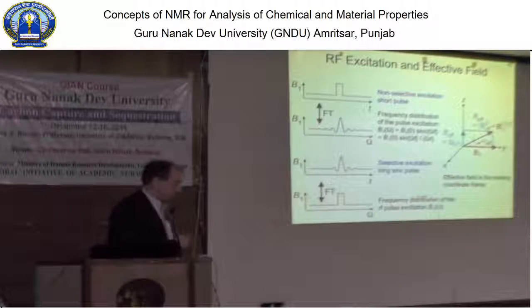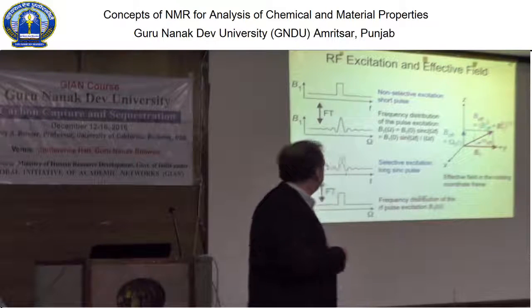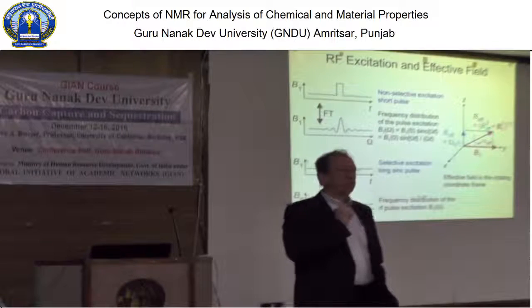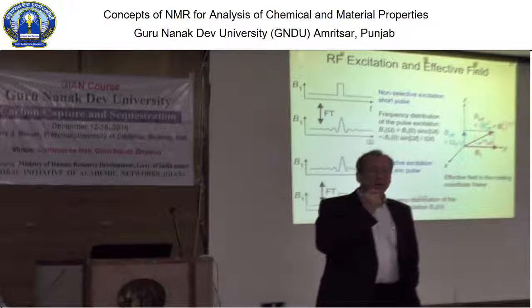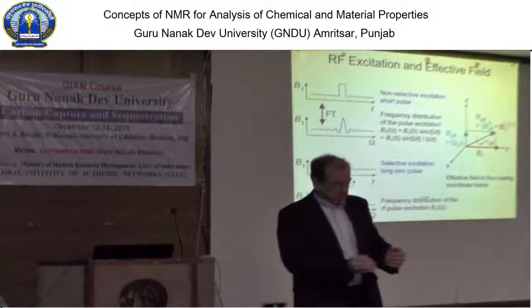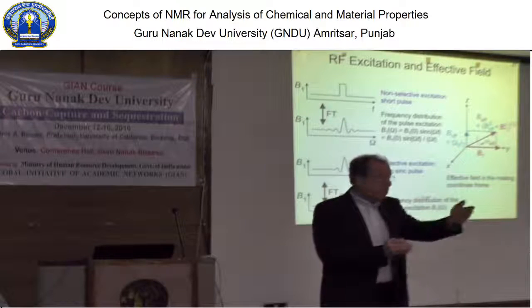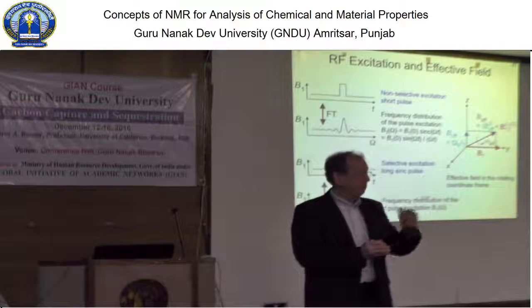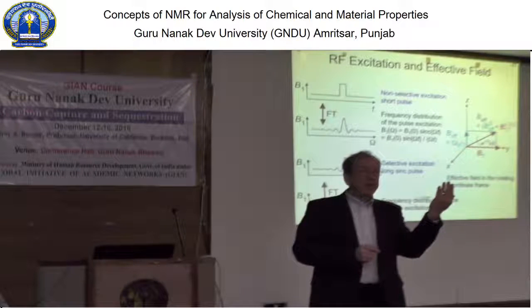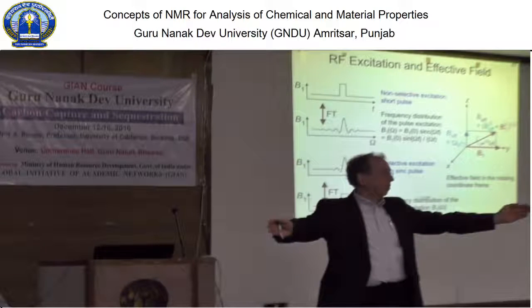Now, it starts getting a bit more complicated. If we are in the rotating frame, we are the red bicycle rider. We are exactly on resonance, with the same frequency as our radio frequency field. But the yellow bicycle rider, who is slightly faster, is the magnetization that we are observing. Now suppose we want to do a 90-degree pulse and rotate the magnetization from the z direction.